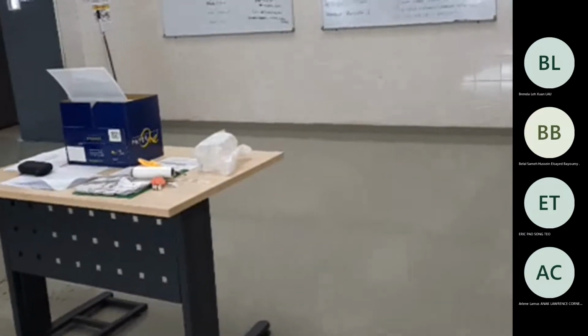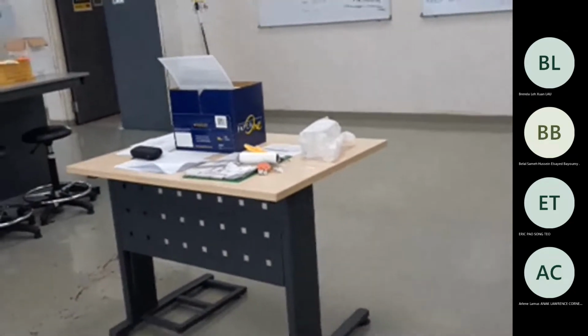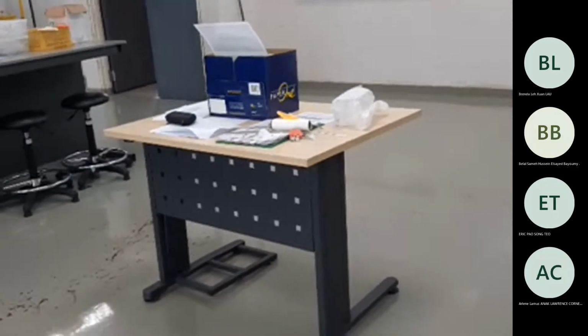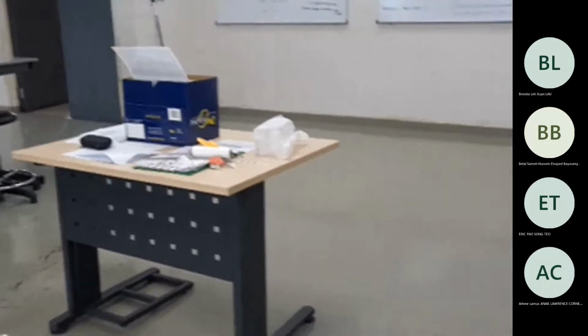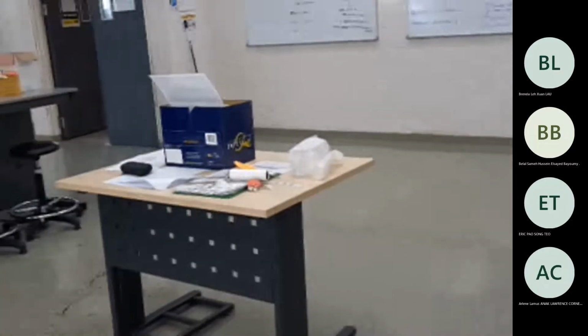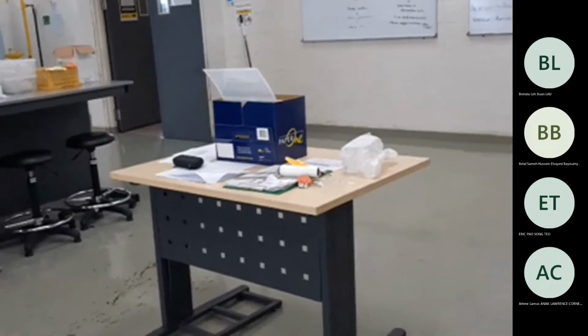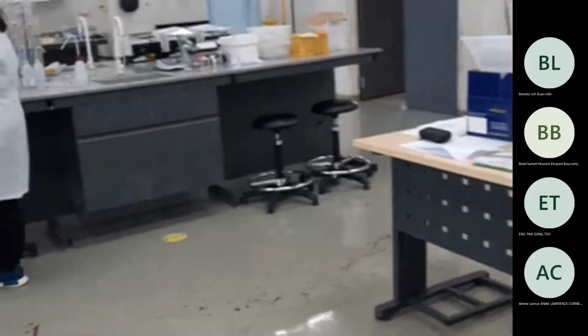I put droppers in fume hood 5 and 6. Take your beaker there, take 5 drops of each in each beaker, and then come here and measure the pH. After you have measured the pH, take out the probe, rinse the probe with distilled water and go for the next beaker.